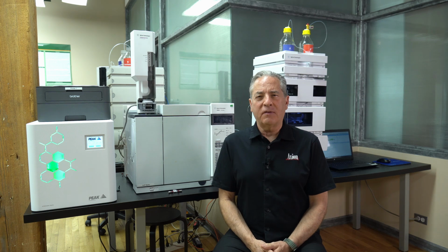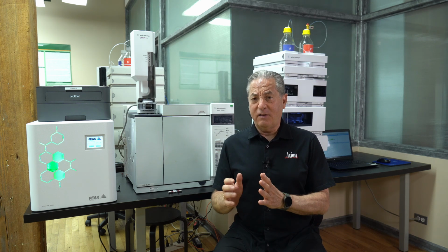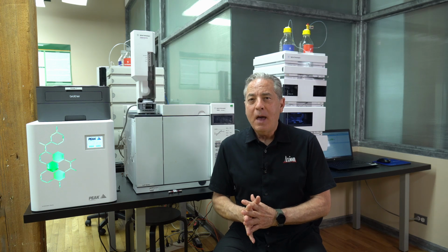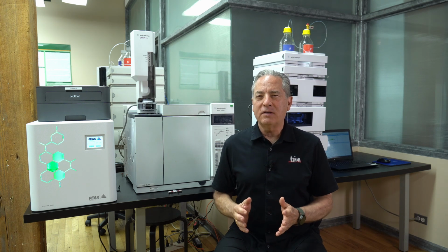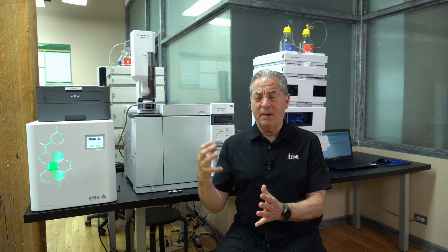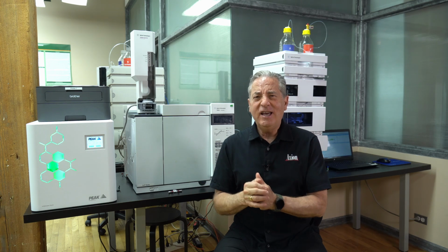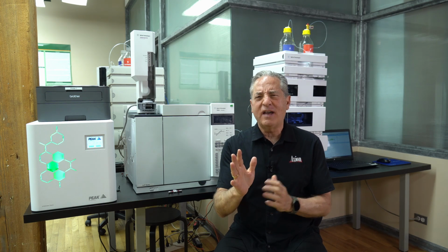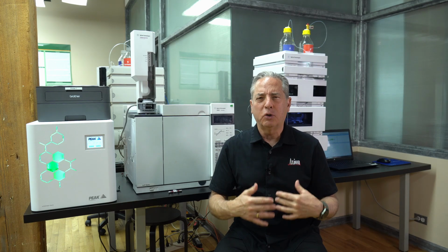In liquid chromatography, there's one more level. Not only is it the relative affinity of the analytes for the stationary phase, but it's the relative affinity for the stationary phase versus the mobile phase. So in LC, the molecules are given a choice. They can spend time in the stationary phase, they can spend time in the mobile phase. Each one has its own attraction. In GC, you basically have the stationary phase, things stick, and the mobile phase plays no role except to push things through the column.